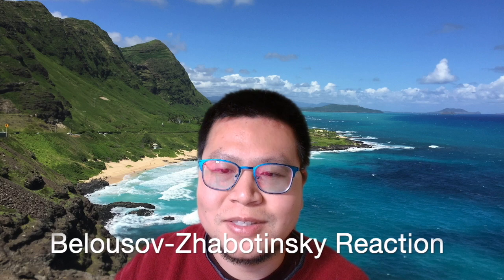This is the third episode of the BZ reaction series. The BZ reaction, also known as the Belousov-Zhabotinsky reaction, is a captivating chemical process exhibiting oscillating behaviors in a non-equilibrium thermodynamic system. It's a prominent example of a chemical oscillator where the concentrations of the key reactants undergo periodic changes over time, resulting in visually striking patterns.